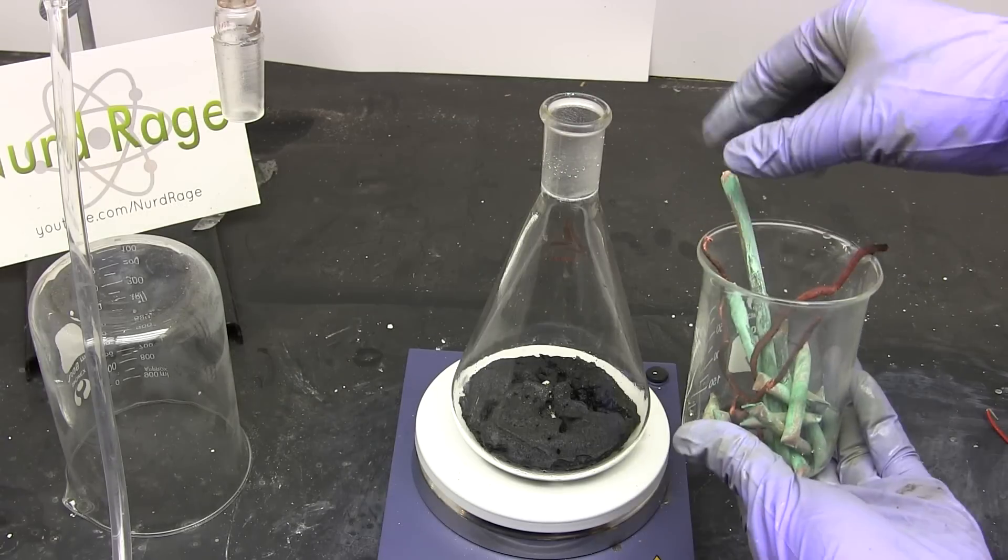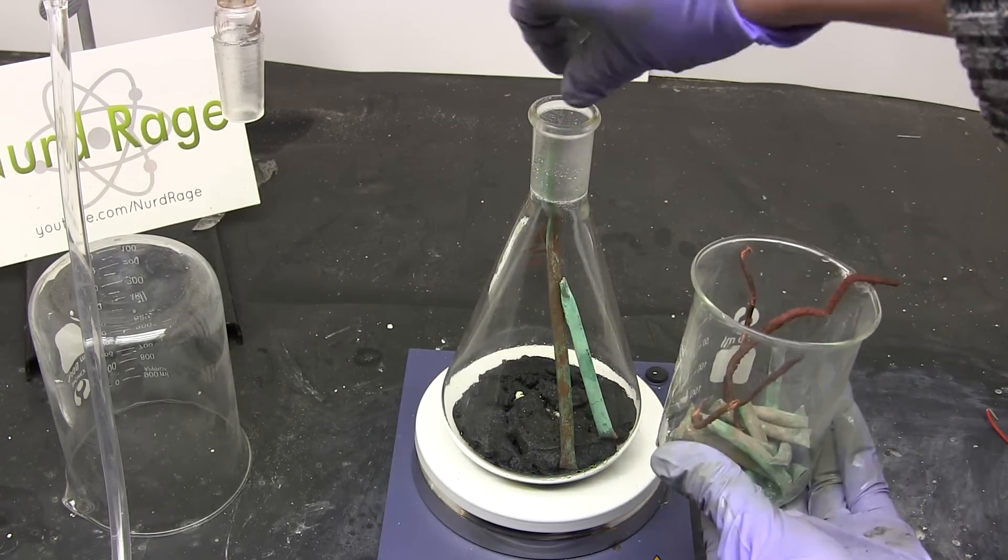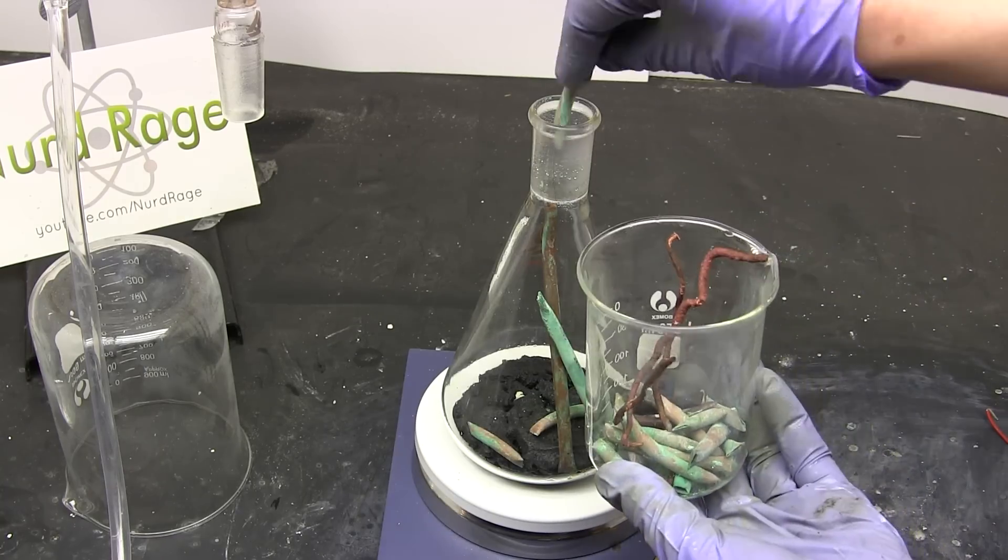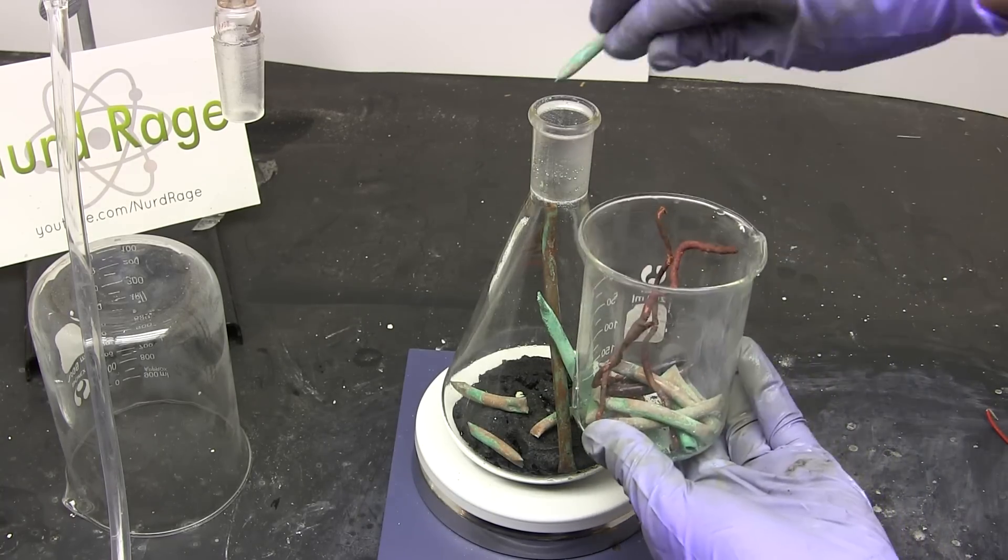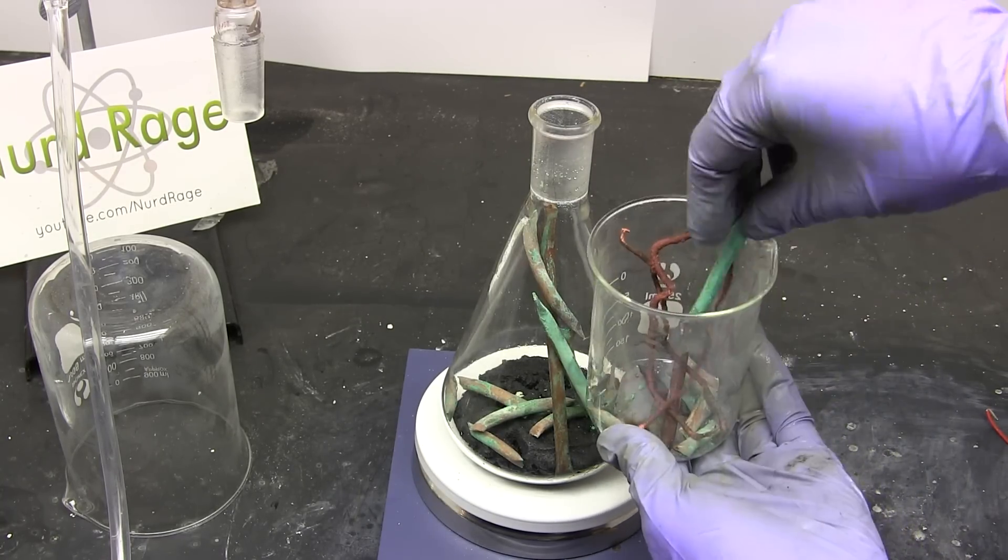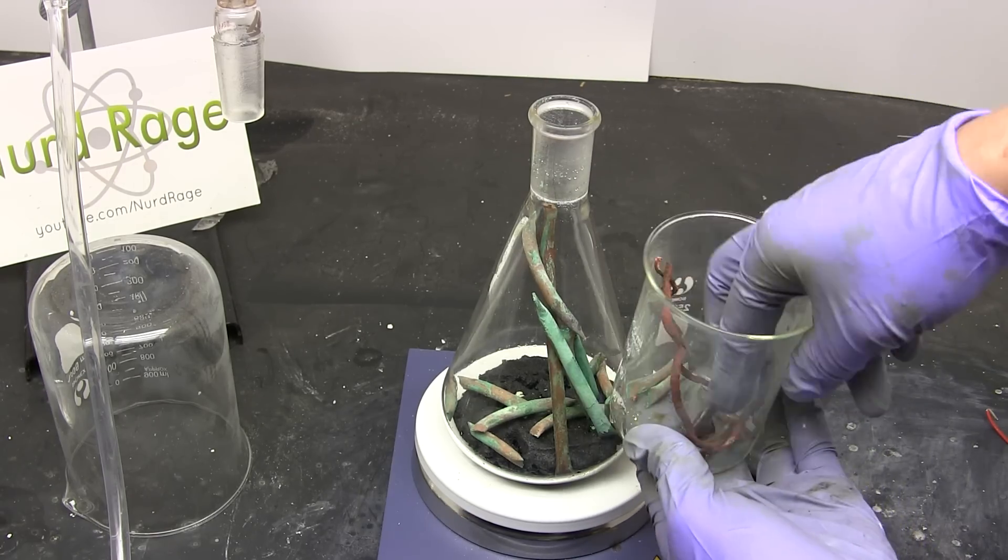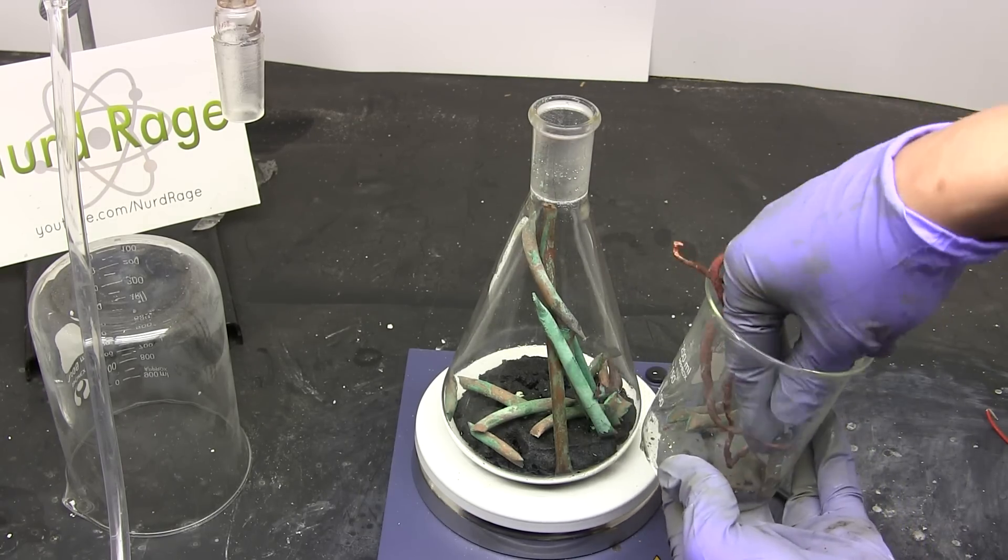Now we add copper metal. We want to completely react all the remaining ferric chloride and copper chlorides. Now if you distilled off the acid to dryness like I did and weighed the residue then the ratio to use is 3 to 1. For every 3g of spent ferric chloride etchant add 1g of copper metal. This is a rather huge excess but we're doing it to ensure the reaction goes to completion.